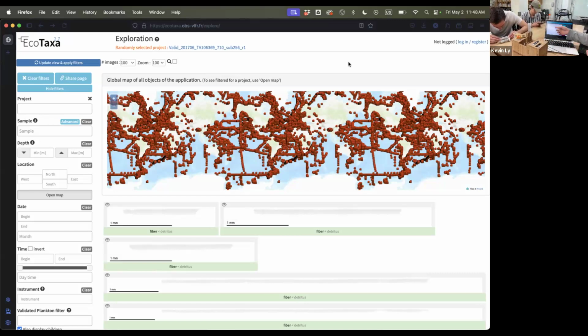But stuff does get stuck in the walls of the glass capillary, so you do need to routinely run bleach through it to kill all the stuff that's stuck and neutralize the sticky substances. You flush with bleach for a while, then rinse with clean water again, and that's usually good enough. Sometimes you also need special paper or cleaning fluid to clean the outsides of the glass capillary tubes. But that's about it.